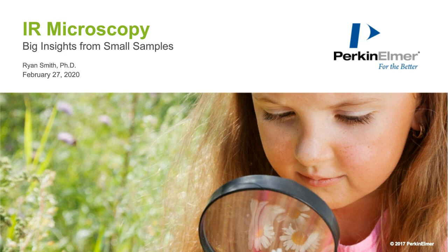I'd like to tell you a little bit about infrared microscopy, and in some respects, this technology is fairly exotic and is not necessarily as widespread as FTIR analysis in general. And so I would like to share a little bit about the theory of the measurement and where this technique is really critical in helping scientists answer some of the toughest challenges they face.